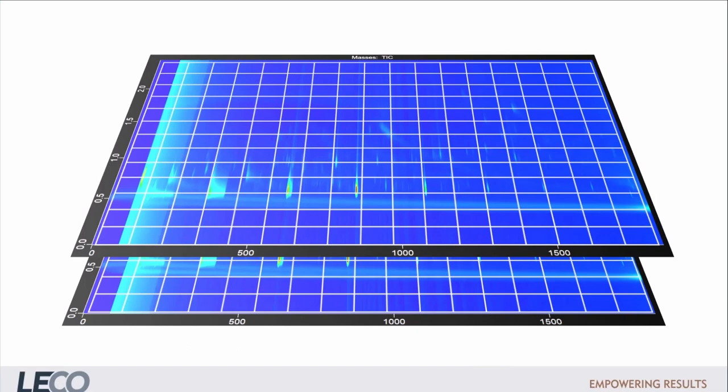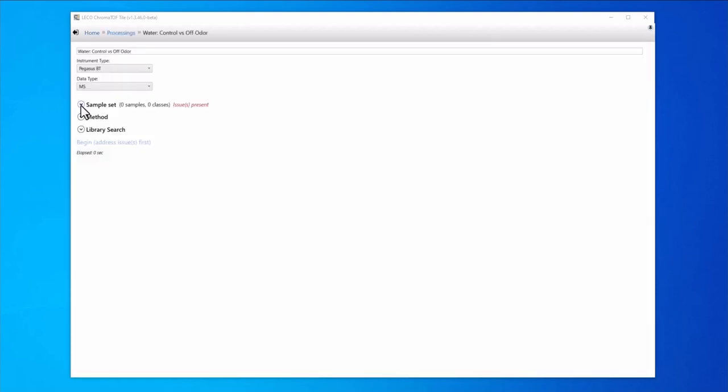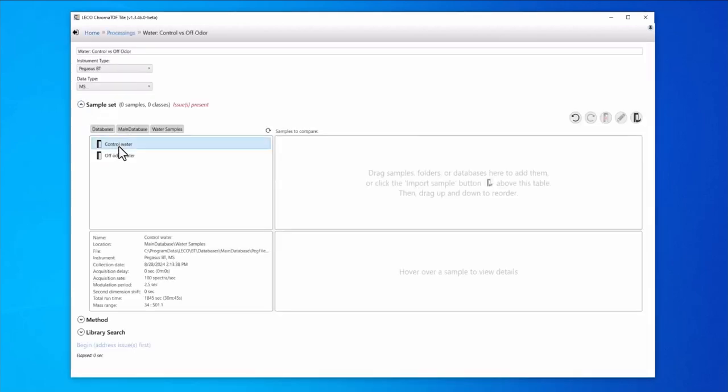This is done with a chromatographic tiling approach, where grids of retention windows are used to connect the samples and then compare them. We create a data processing method with the ChromaTOF Tile software. Then select the samples that we want to compare from our ChromaTOF database.